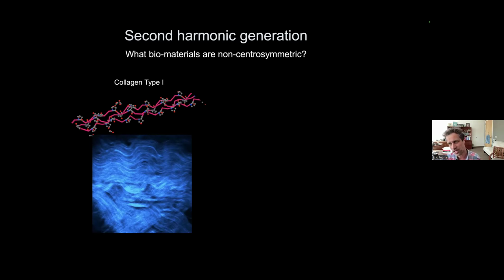But people don't tell you that if you are very small, a very tiny person as big as a molecule, then everything else around you is basically non-centrosymmetric. There are very few molecules in biology that are purely centrosymmetric. The problem is, if you have a focal volume of about a micron, then you have a lot of molecules with all kinds of orientations.